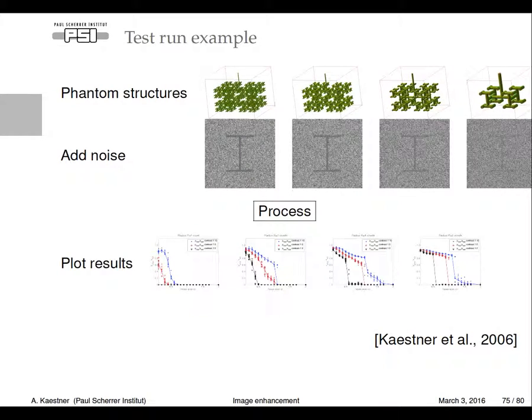So here is an example. Here I created a test structure, which should be a kind of root system with different thickness of structures. Then I added noise at different levels and started processing. Actually, the whole sequence was about seeing how much of the structure I could segment. So these breakdown plots also include the segmentation.